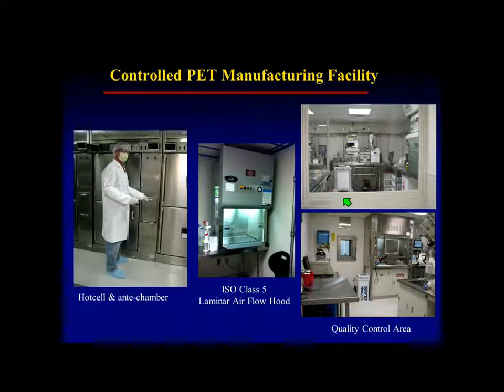This just is an example of our facility. Again, for producing these PET drugs, you're not required to wear bunny suits. What you are required to do is wear head covers, face masks, and clean laboratory clothing. But you can notice he's got jeans on. He does have booties, and those aren't for radiation safety purposes, but for keeping the area clean. So we use it all the time.